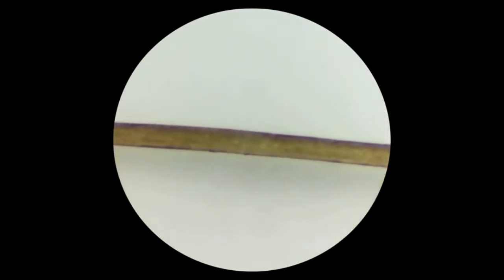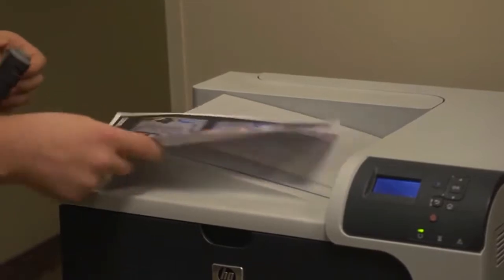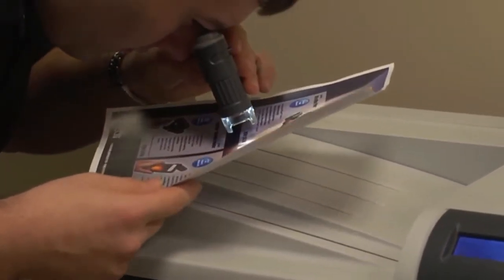With the lenses in this device even a thin strand of hair will deliver some pretty impressive results. And the lenses in this device are aspheric, that means less distortion and a better overall image for the user.